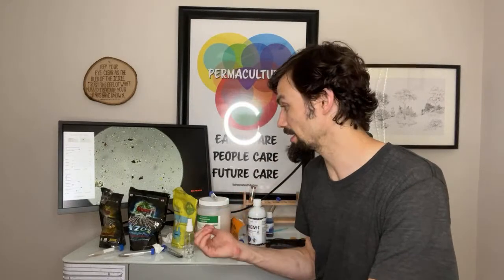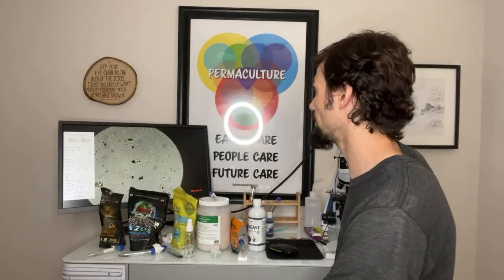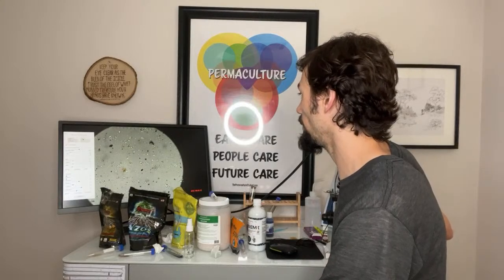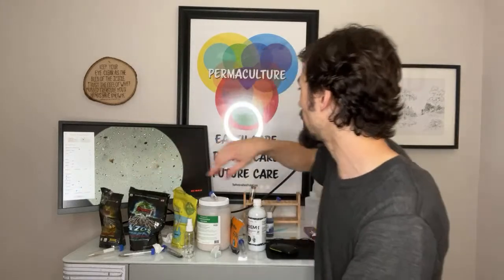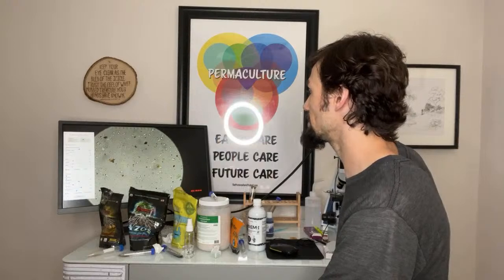In all my studies, the compost that's good is always going to have more hyphae than the inoculants. So it's usually spores that you see, unless it's really good. And that's what Mike Amaranthus has always done. So yeah, I see spores all over the place. They're like little basketballs, very, very round, and then intricate edges.